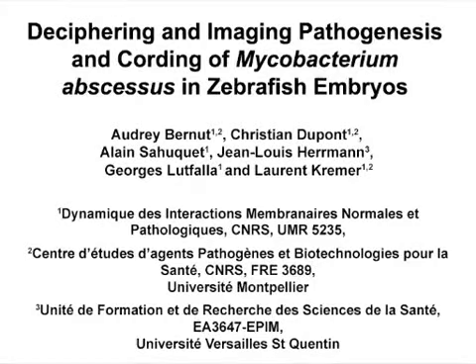The overall goal of this procedure is to study and compare the virulence of Mycobacterium abscessus strains and to describe the interactions between these bacteria and the host innate immune system in vivo using transparent zebrafish embryos.